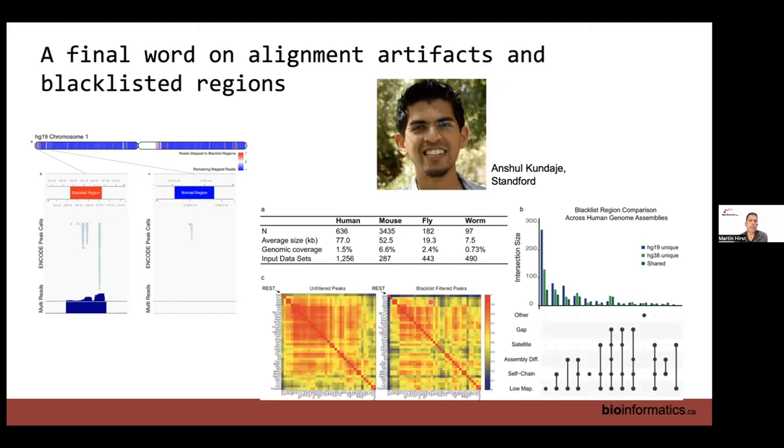Well, it turns out that in the reference genome, and certainly this is true in the human genome and also true in most mammalian genomes, the assemblies are not complete, as I think we know, certainly for HG38. There are regions of the genome that are represented only once in the assembly that you're using, but in the genome that you've sequenced, they're represented multiple times. So what's the consequence of that? This is a repetitive region that's, say, present 1,000 times in the genome that you're sequencing, but only present once or twice or even less in the reference genome.